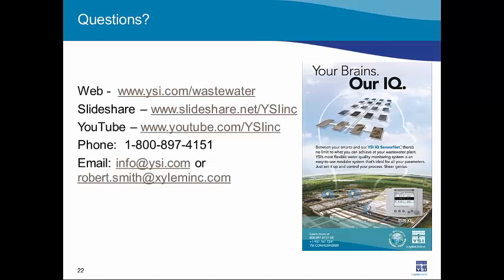On the other hand, I know we have customers who have gone 2 or 3 months between matrix adjustments, and a lot of it also has to do with the concentrations you're measuring and the exactness of the measurement you're seeking. But that's a good question. Thank you.